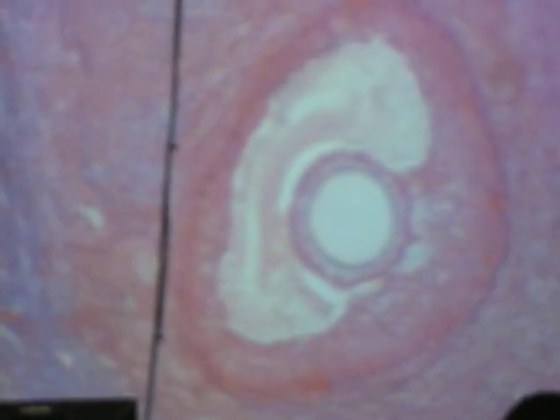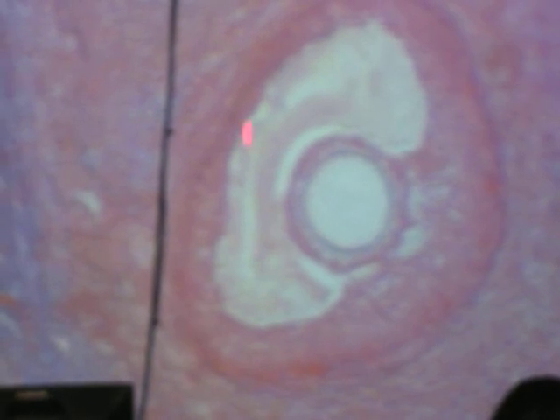You're going to scroll around a little bit more on the same slide, and I'm going to put up a different one just for better visual representation. And you're going to see something like this, where the antrum is significantly expanded. This is called a Graafian follicle, or vesicular follicle. The Graafian follicle, look at the much more pronounced and extensive antrum.